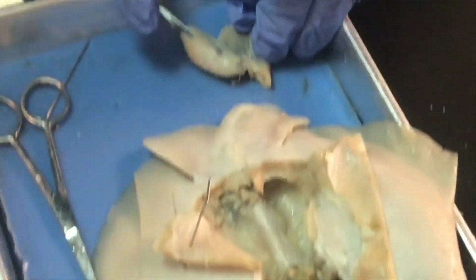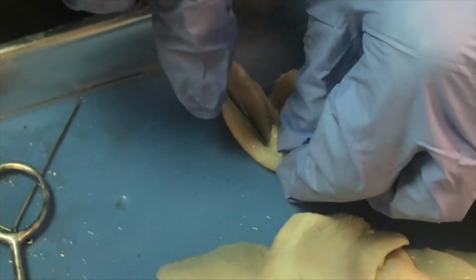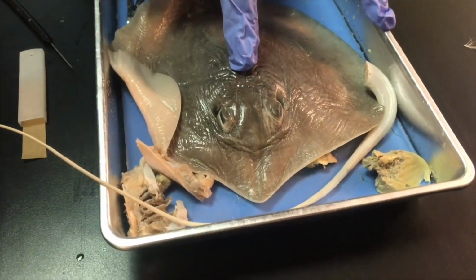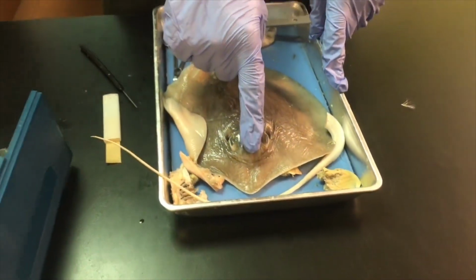Yeah, my gills kind of fell apart. Cutting into the gummy worm part, okay, that's not the scientific name, to the intestine. So bleach it out and wipe it out. Doesn't that look just delicious? Come on, back up first.